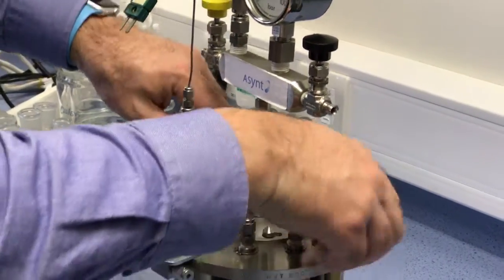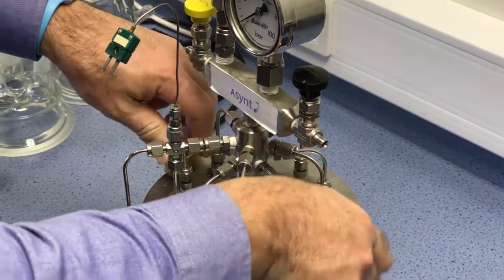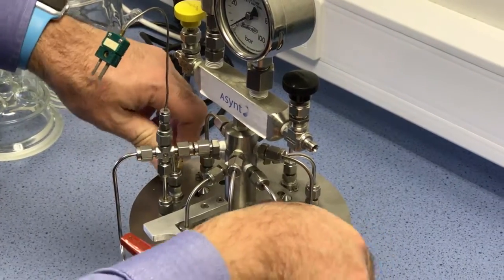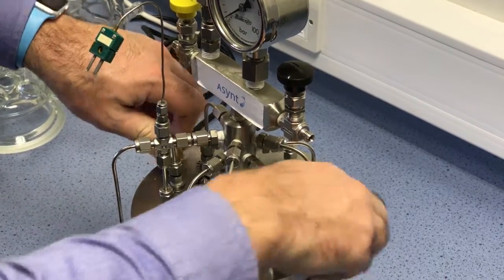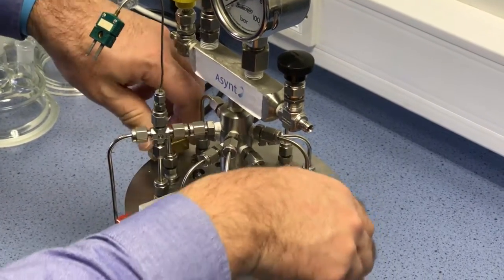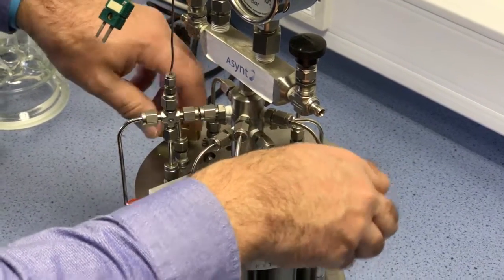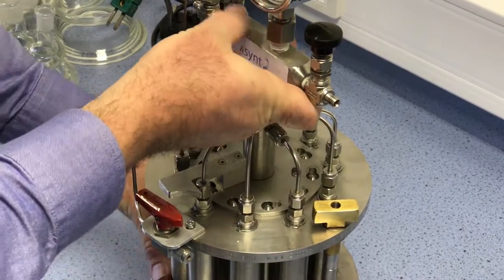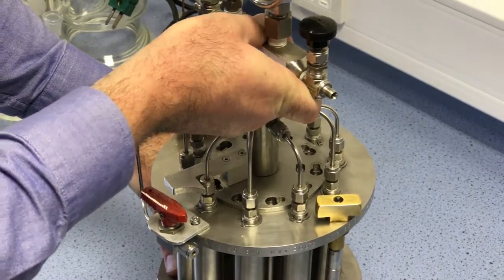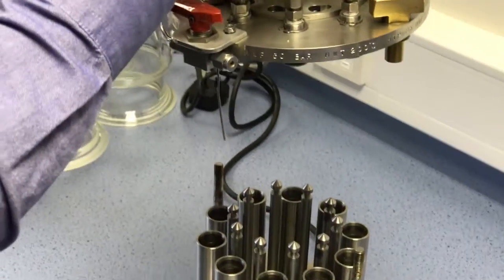Once we're there then we start to evenly unscrew each of the rods until they're both fully unscrewed. We can feel the threads come to an end. Then it's a case of lifting and separating the unit carefully.